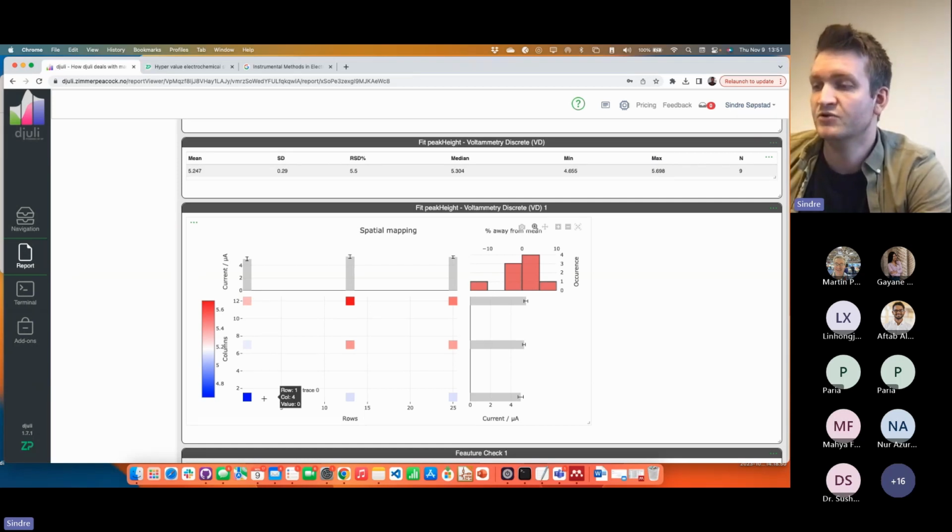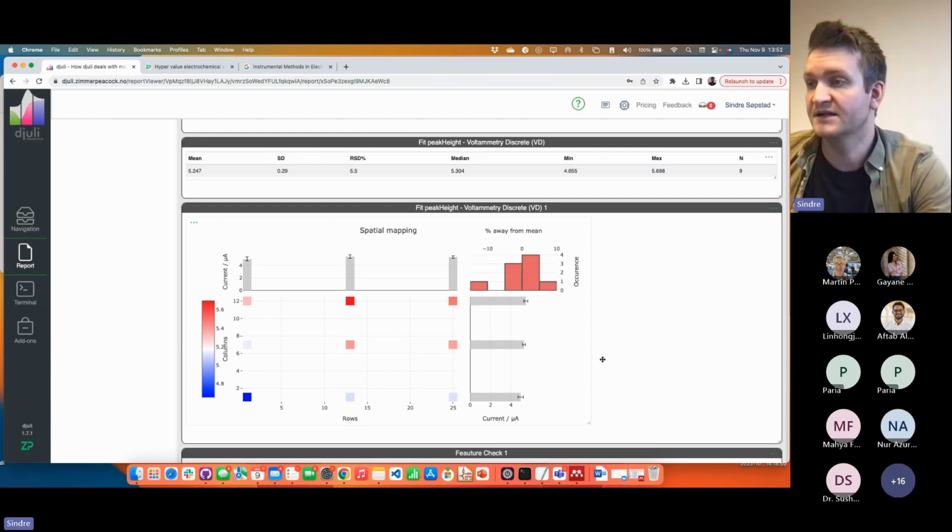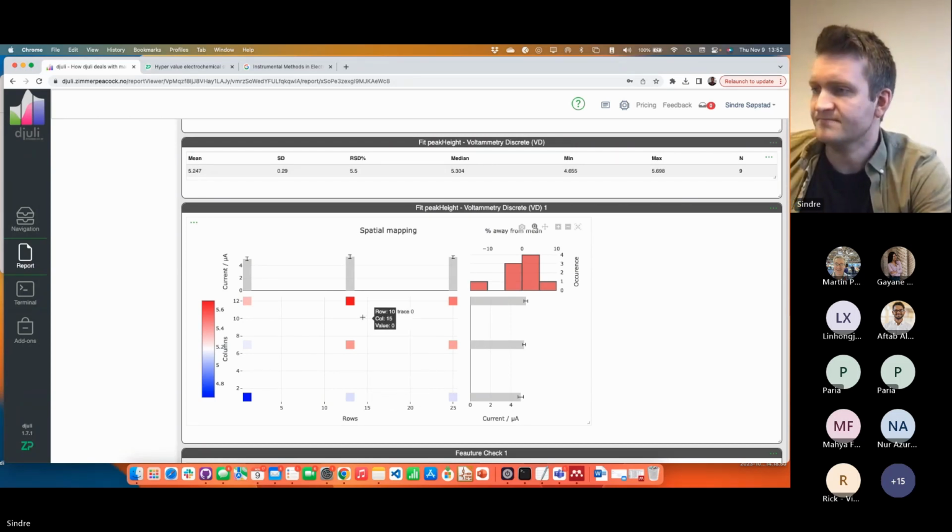That means blue spots are lower than the average, which is around 5.2, and red spots are higher. So you can see now, if I took more samples here, I could, for example, identify hotspots that would be indicative of something going wrong with the production in that spot. Now, in this case, we're pretty okay. The extremes are not deviating that much from the average value.